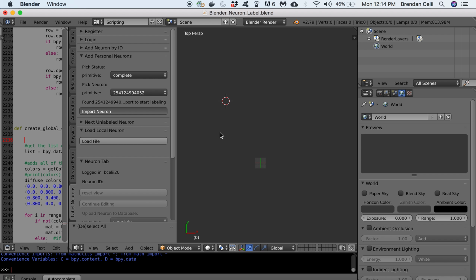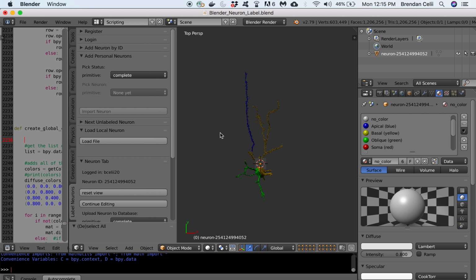So this is, again, a step that takes a little bit. Okay, so here's the deal.